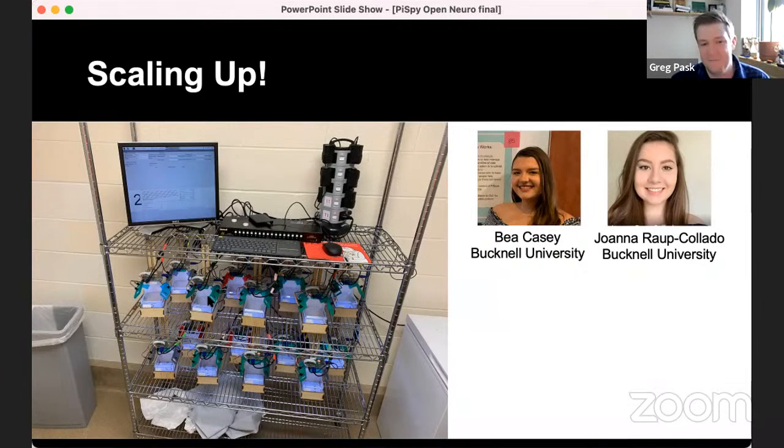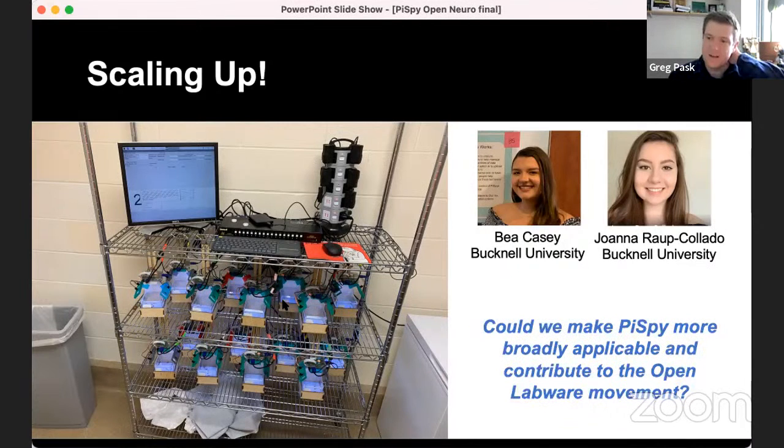And we were able to monitor all these colonies, these ant colonies, in parallel. We started to share this with the community, presented at conferences, and a lot of people really were interested in this idea and had use for this very simple idea of just, let's just take videos and images.